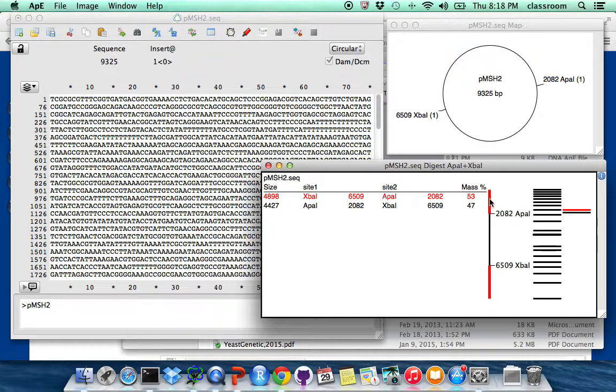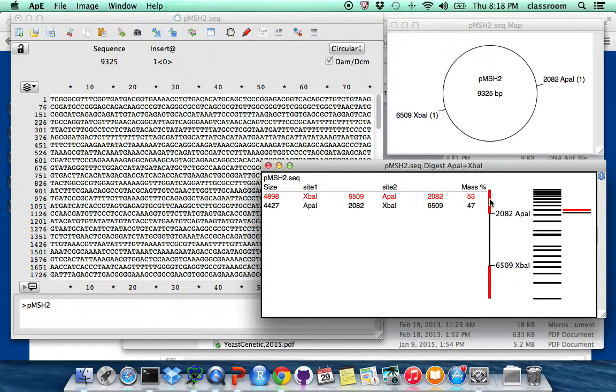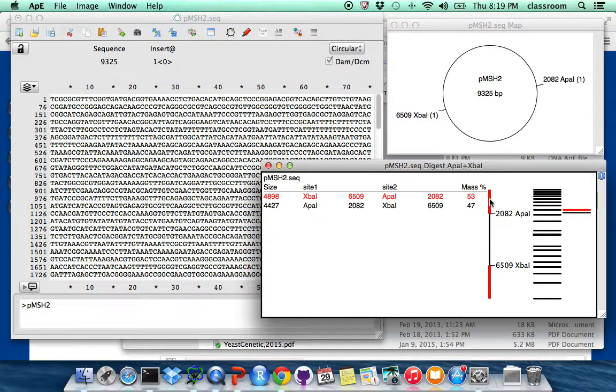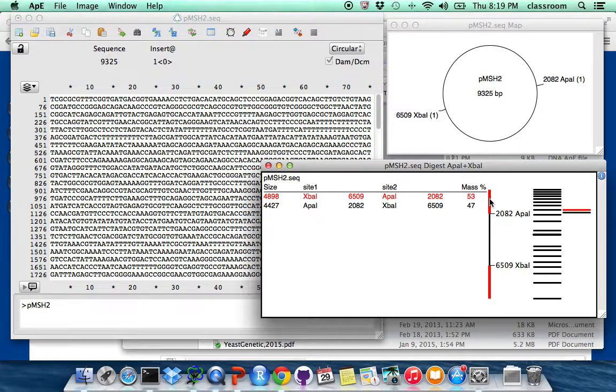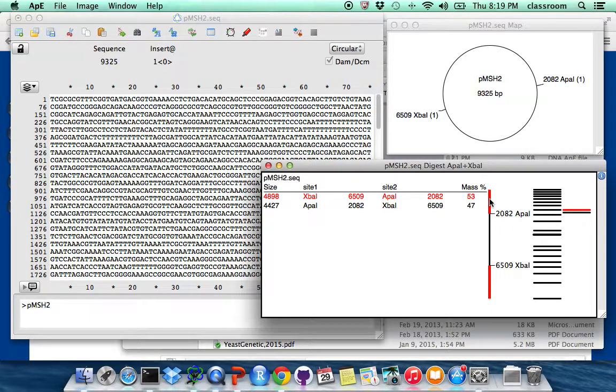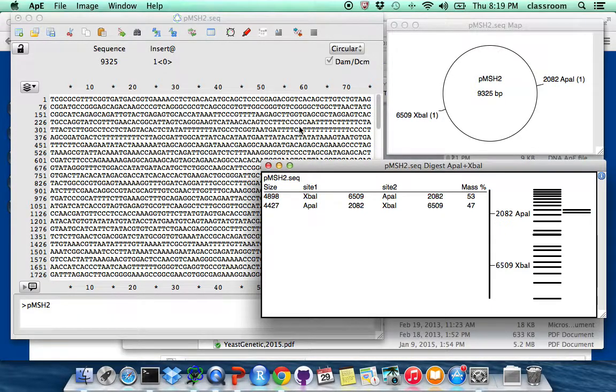Okay, please do this exercise on a different plasmid and then figure out, you can pick a different enzyme or use the same enzyme and then see whether, then try to estimate the size first on a paper, and then run simulation, see whether your estimations are the same as APE does. Okay, have fun.